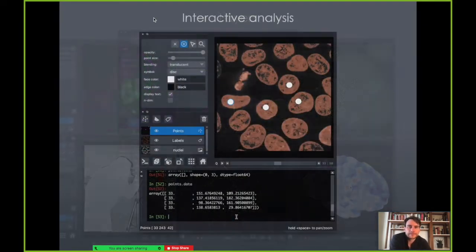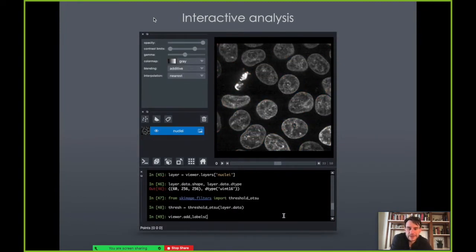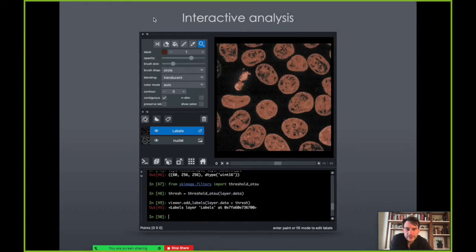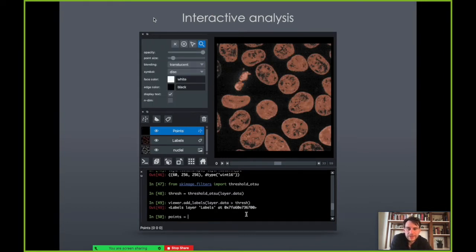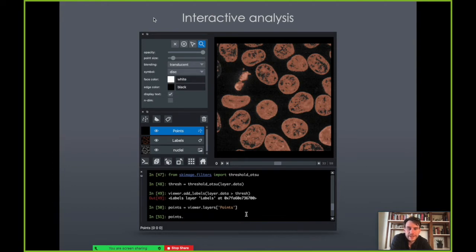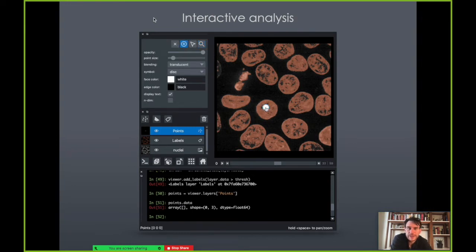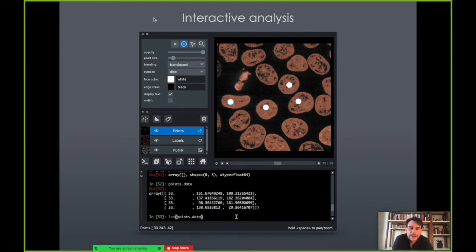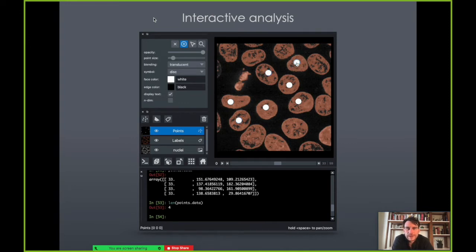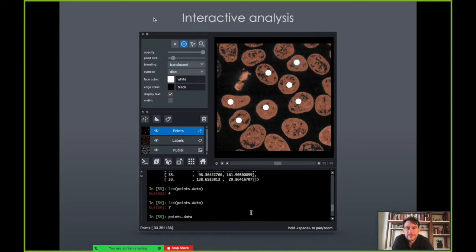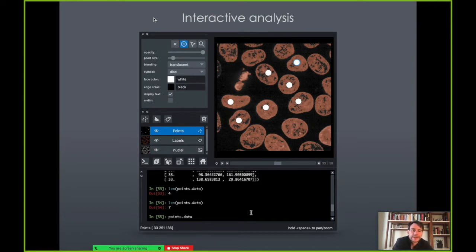Another thing that is really core to Napari is interactive analysis. Here you can see we've got a console at the bottom — this could be a Jupyter notebook or an IPython terminal. We've added a points layer. If we look at the points data right now it's empty, but if we manually start adding some points and come back to the console, we can see a NumPy array. If we ask how many points there are, it's four. Add some more and it's seven. You can be doing things in the GUI and then go into the console and get access to those Python objects right away — great for developing new analyses.